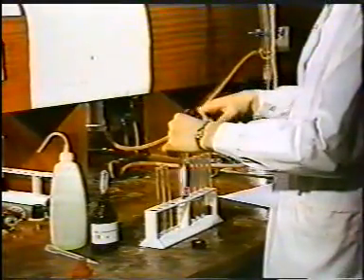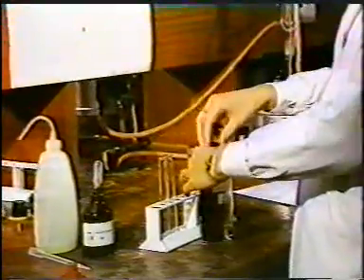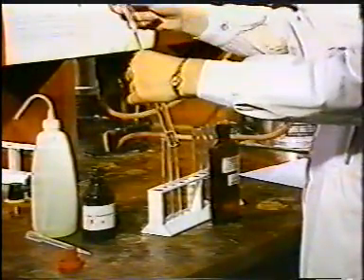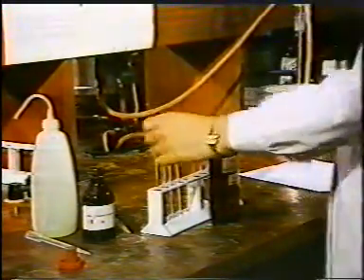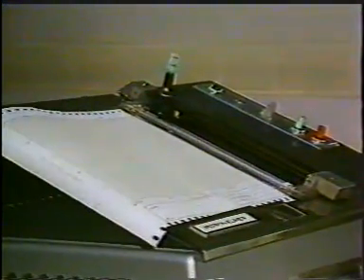Identity tests may involve simple chemical tests, or the determination of a variety of physical constants, such as melting point, weight per mil, or refractive index. The determination of the infrared spectrum is often used for organic compounds.